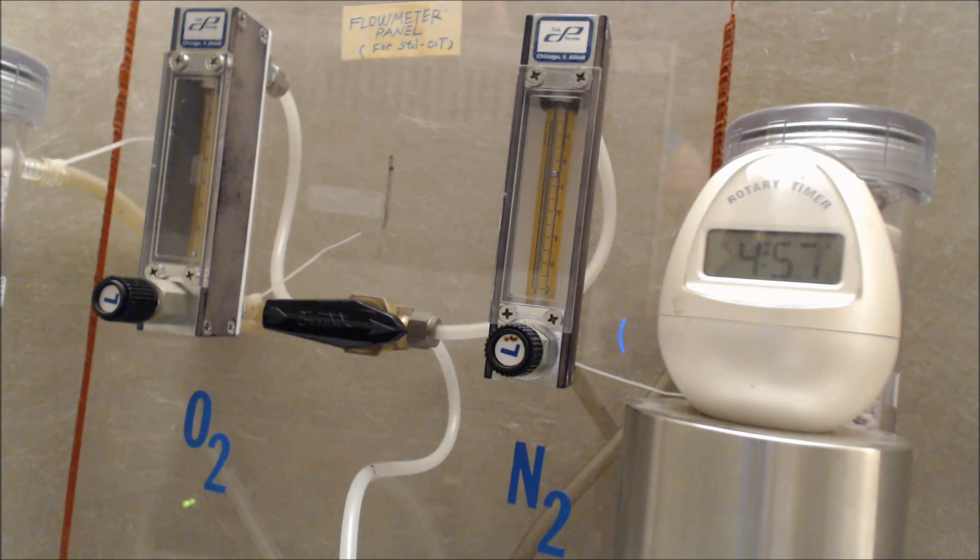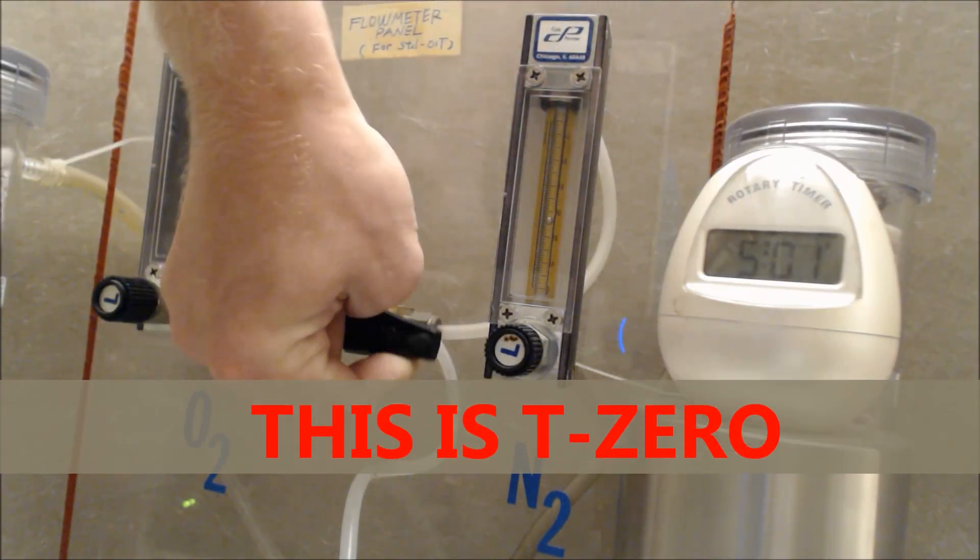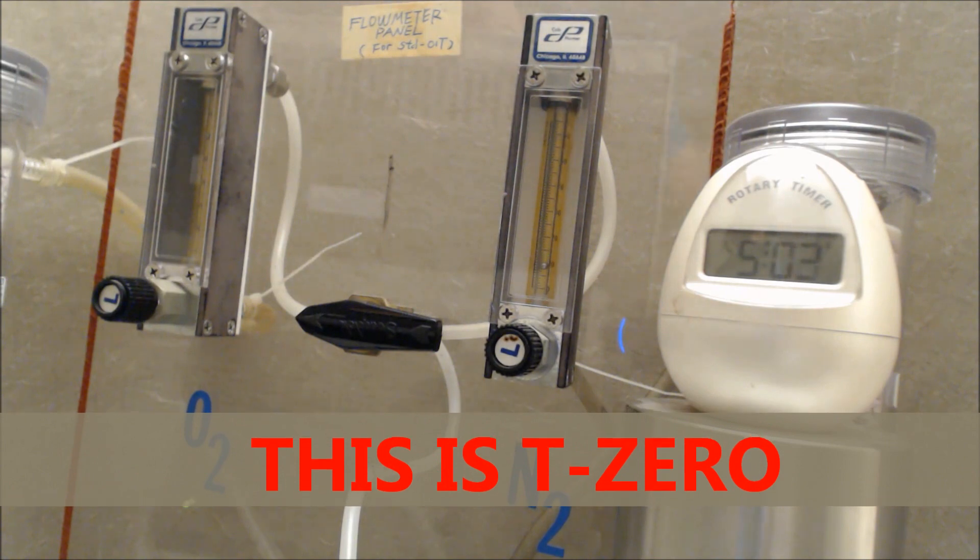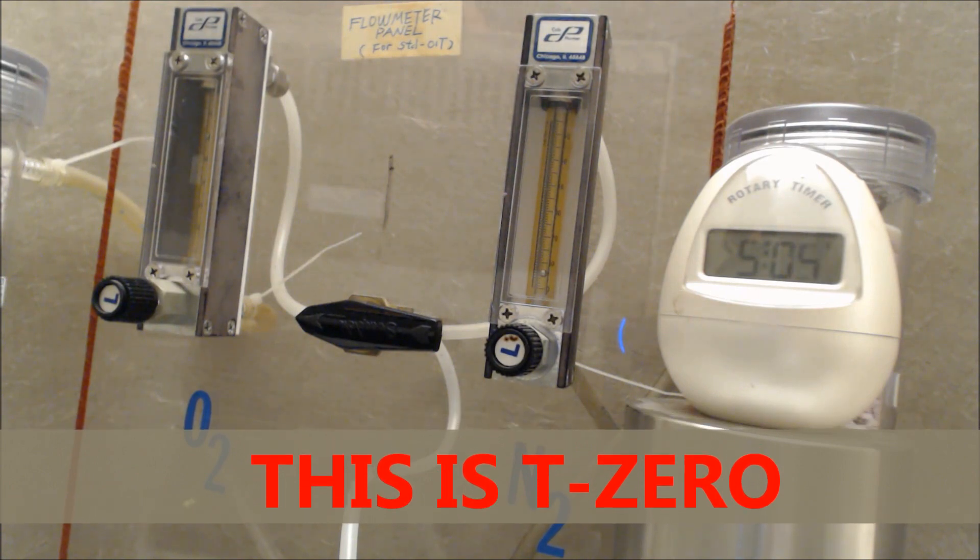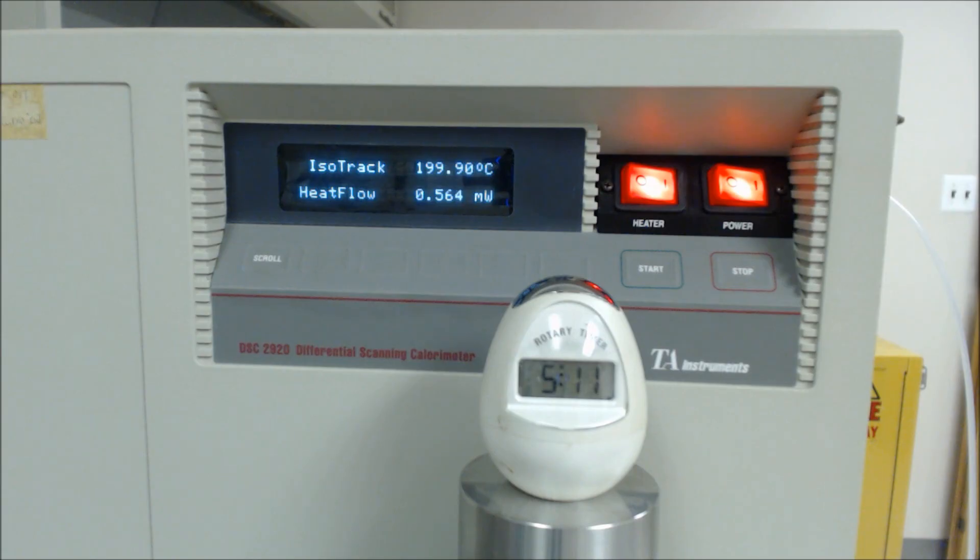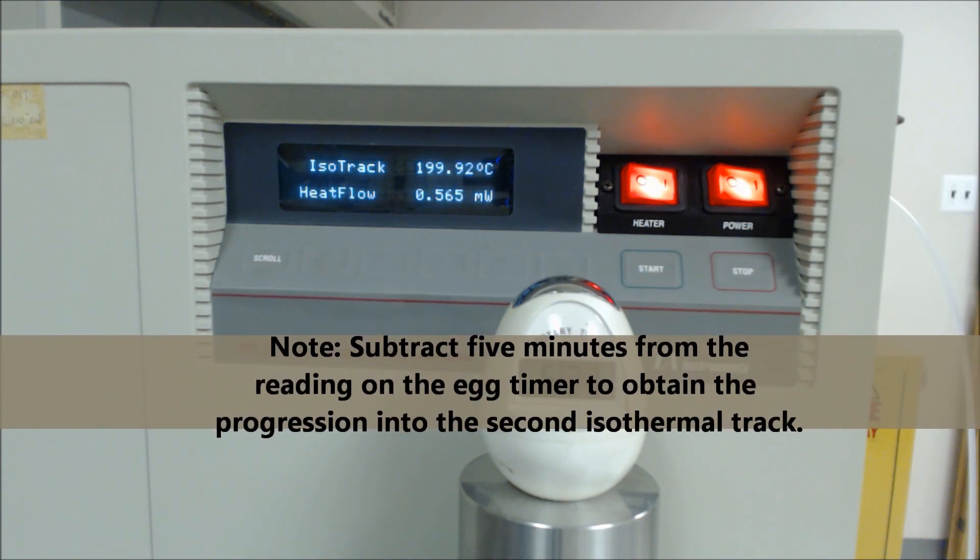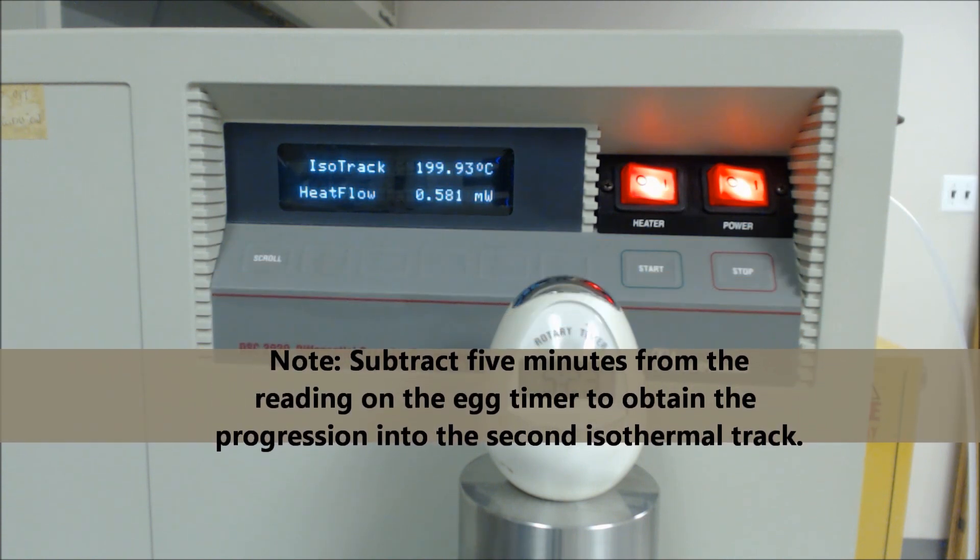Here you see the 5 minute mark on the timer, marking our T sub 0 for this test. The gas is switched on the flow meter panel, making sure the pressure and flow regulators for the oxygen gas read as they should, 50 milliliters a minute and 34 kilopascals or 5 psi. The absolute time must be then noted. For this test, T sub 0 occurred 13.93 minutes after the cell began to heat up. Please note that our particular software reports in minutes to the decimal, instead of minutes and seconds.